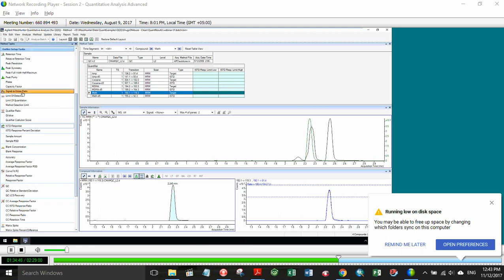But then certain other things, like signal-to-noise ratio, are another one where you notice we only have a minimum. We don't make an allowance for a maximum. Most people aren't concerned that if they're getting 20,000 signal-to-noise, that's great. But they'd be concerned if they were getting less than 5, say. So a lot of these, as Steve and I describe them, are one-dimensional. We only have a lower limit in this case for those.